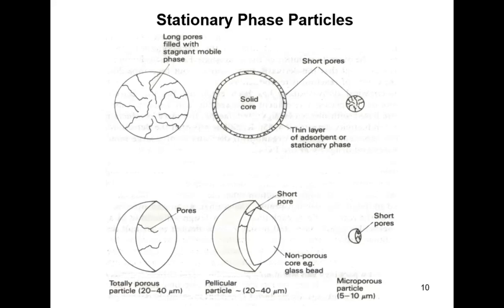They're not completely solid materials. They are a bit porous. So there are these little channels going through the middle of the silica particles, which is unavoidable. What can happen is you can get the mobile phase slowly diffusing in and out of these channels. So a certain proportion of the mobile phase, and hence your sample molecules, are slowly diffusing in and out of these pores, and that's going to increase the effect of diffusion on broadening the peaks in your chromatogram.